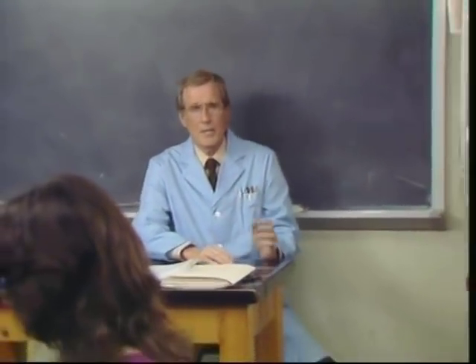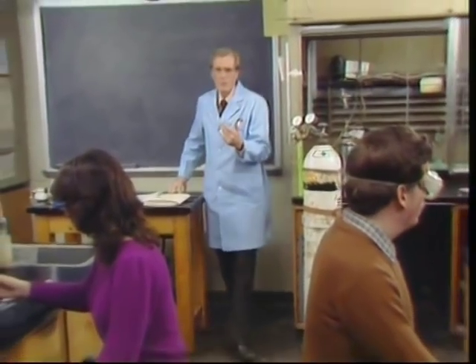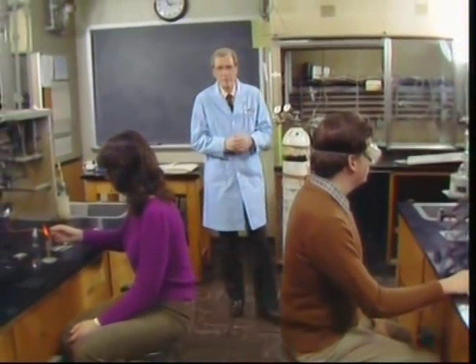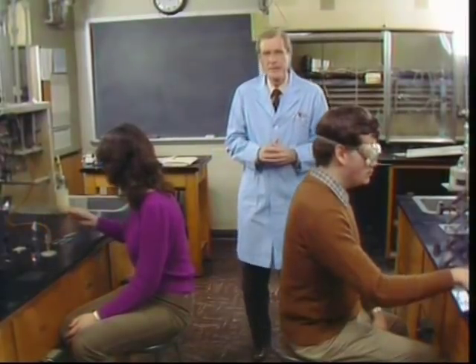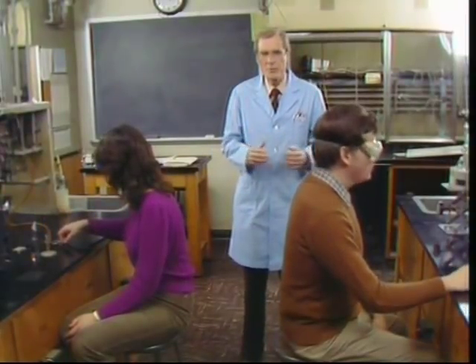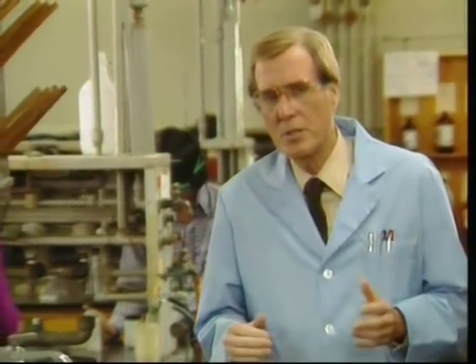Because the labs are occupied by many other students, you should consider the safety of the people around you as well as your own. Never mix chemicals unless directed to do so. The risk is too great. An unexpected and potentially dangerous reaction could result. Remember, prevention and safe procedures can minimize the danger of an accident.